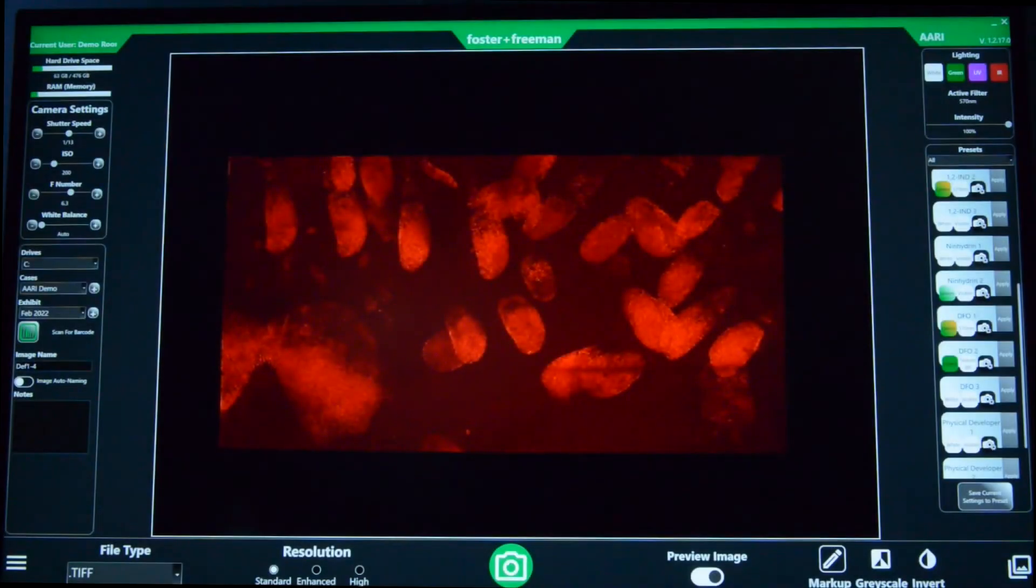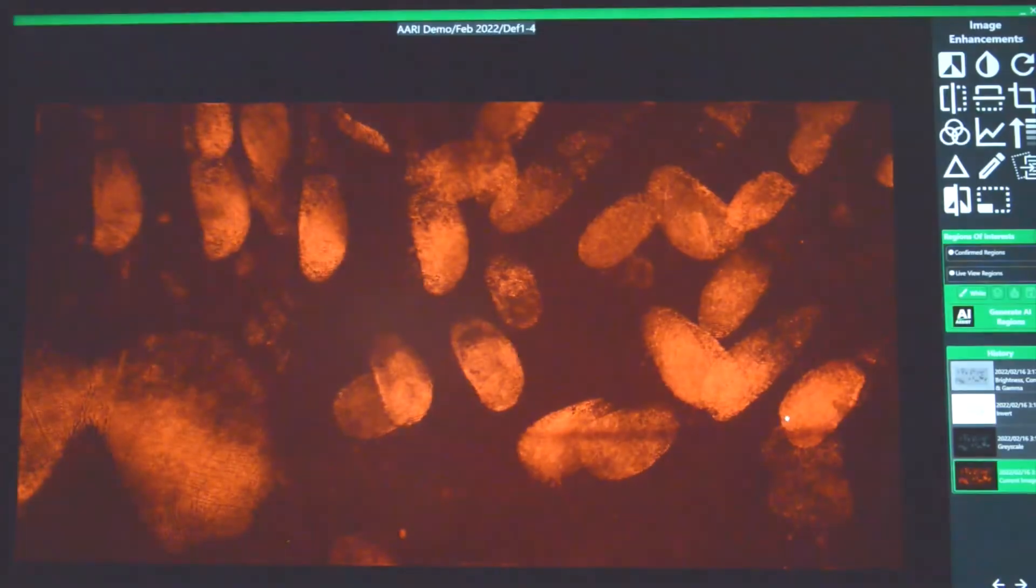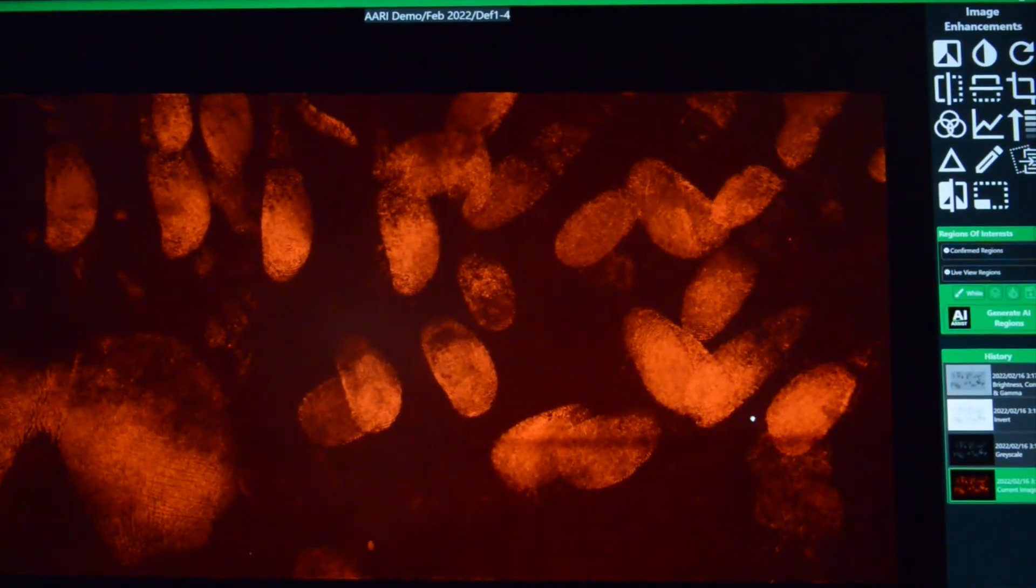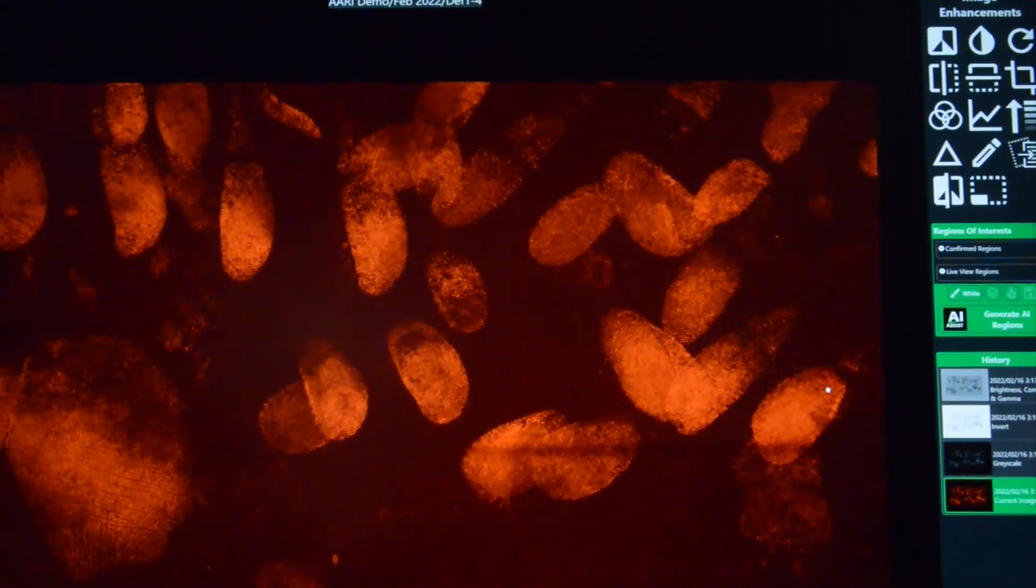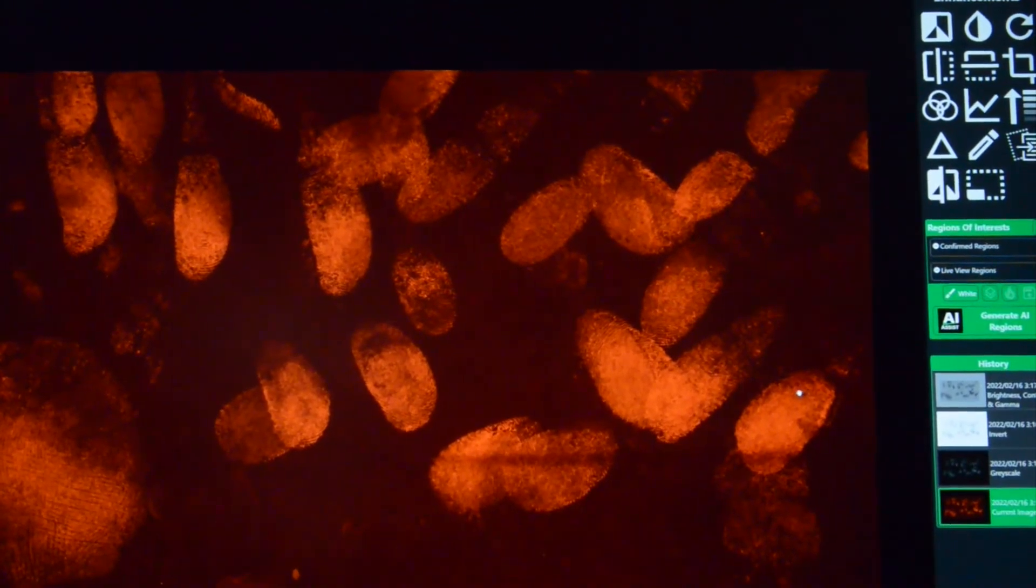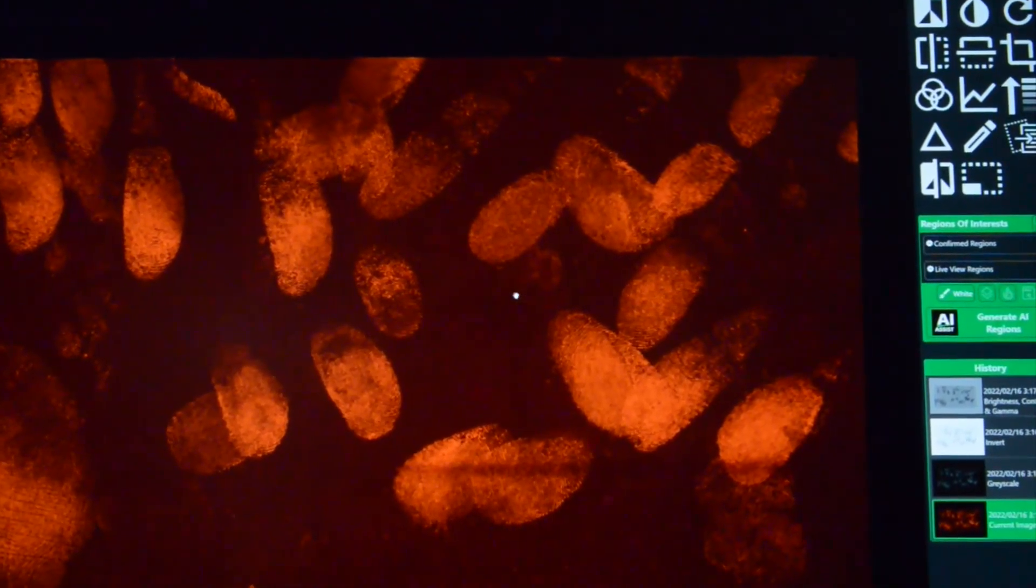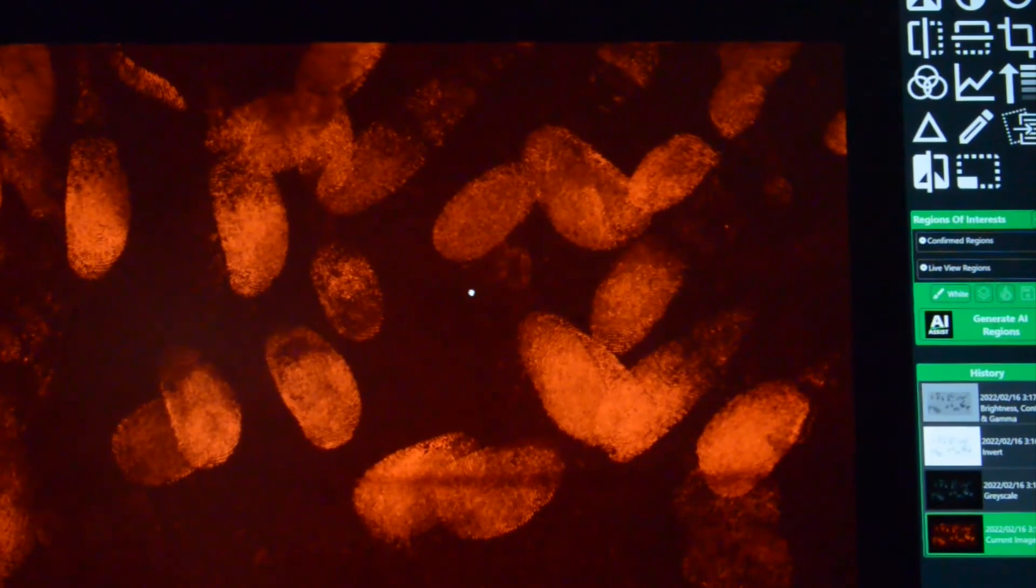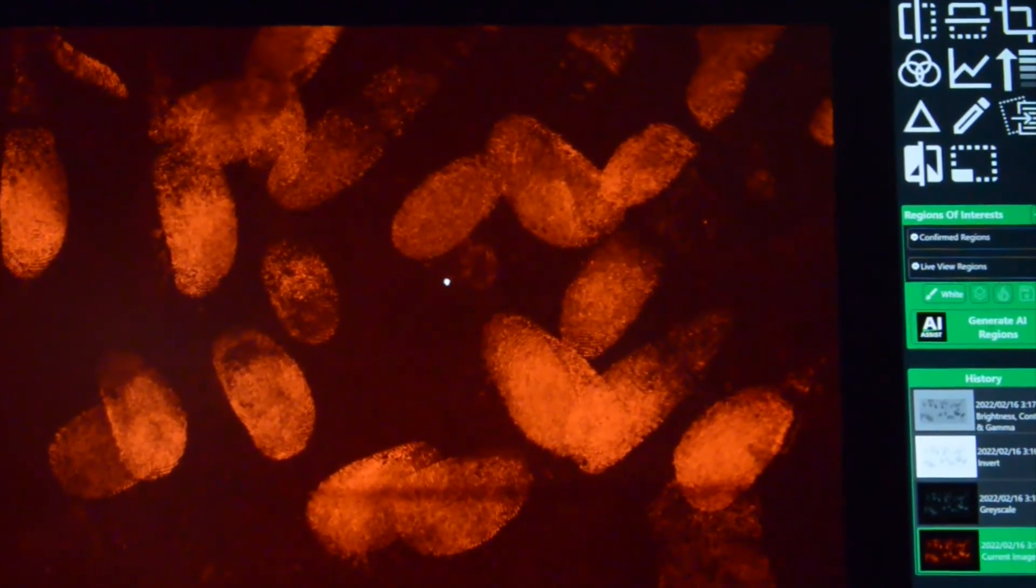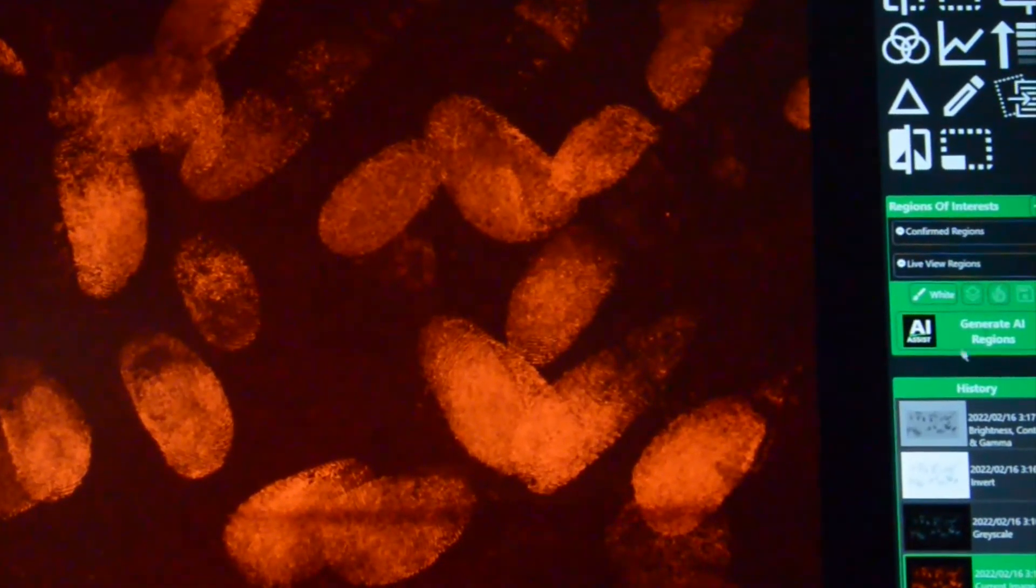So let's capture our image. Now, our really fascinating feature with the AARI is our AI-assisted ridge detection technology. It's not designed to replace the examiner, it's designed to help the examiner to find more marks more quickly and more efficiently.